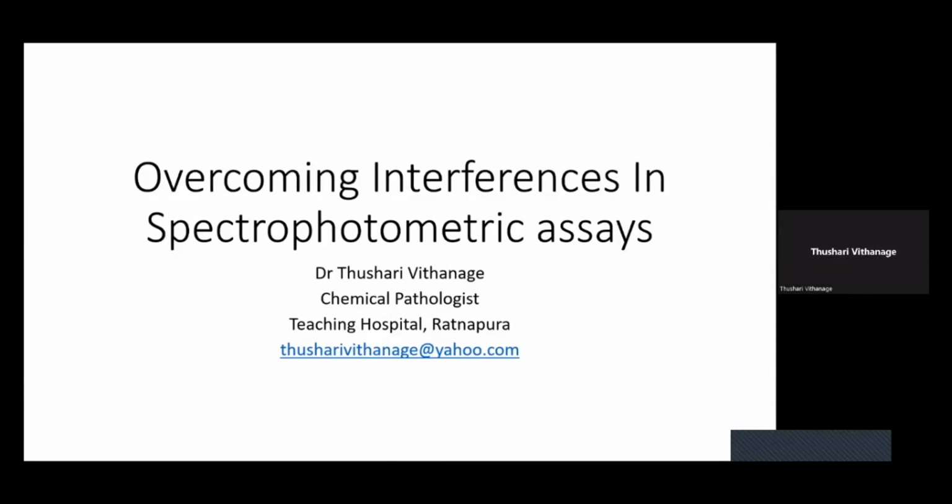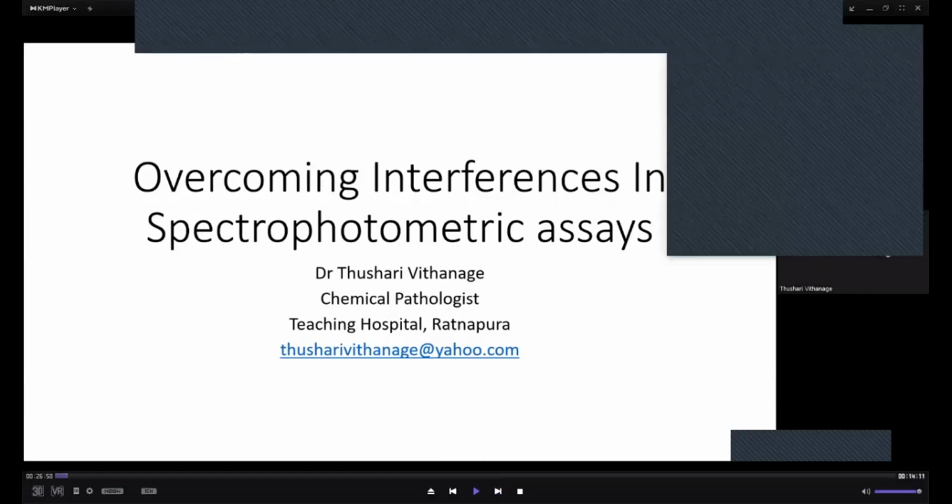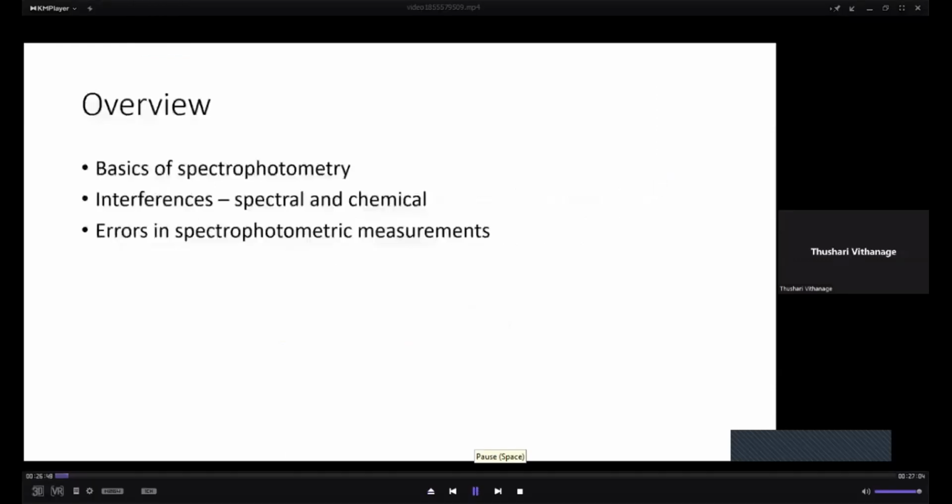Today my talk is on overcoming interferences in spectrophotometric assays. This is my overview, basics of spectrophotometry, interferences.